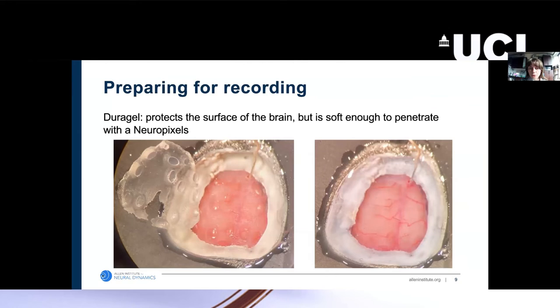Right before we perform the recording, we cover the implant with a stiff silicone elastomer to protect the surface of the brain while the mouse is recovering. But then right before we record, we remove that and replace it with Duragel. The Duragel, when used to cover the entire surface of the implant, is very good at protecting the surface of the brain, and we have not had any issues with Duragel sticking to the Neuropixels probes. One downside is that it's not conductive, so you must ensure the mouse is properly grounded. We have a special hole in the implant for a ground wire that we insert before applying the Duragel to ensure grounding contact with the brain surface.